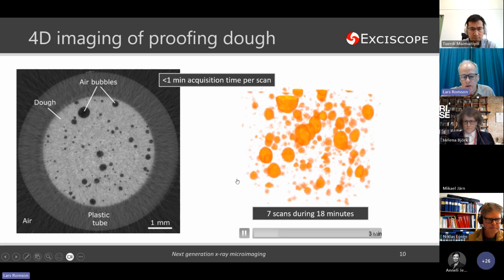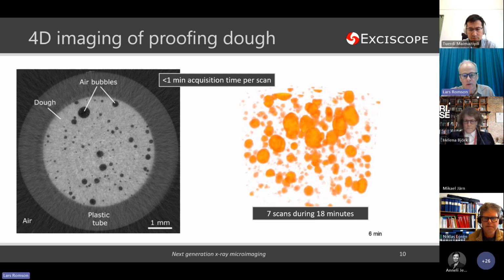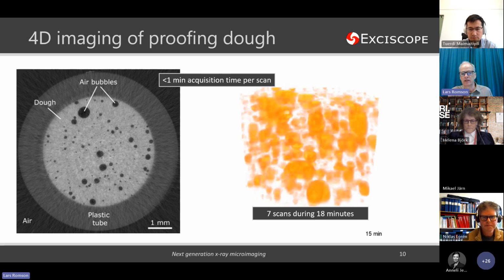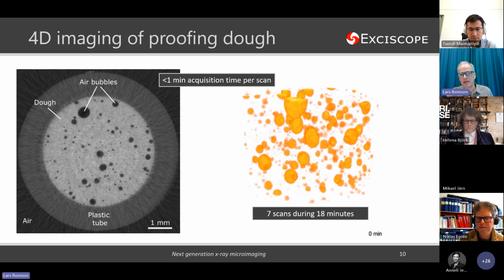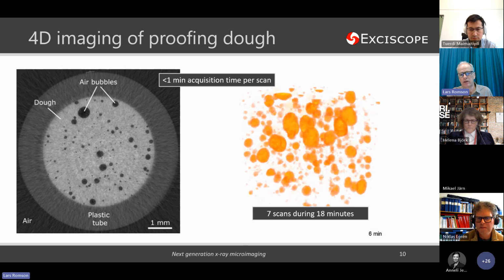Let's see if this works. Yes, Tuerdi mentioned baking. So this is a rising dough, actually, where we do 1 minute scans over an 18-minute time period.